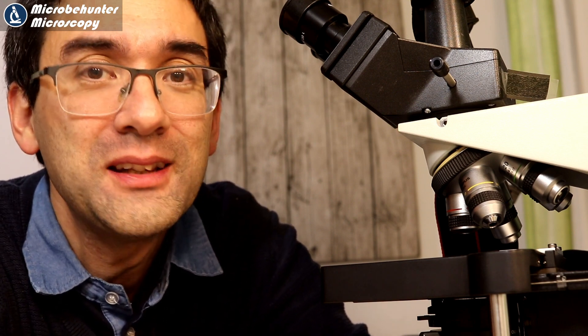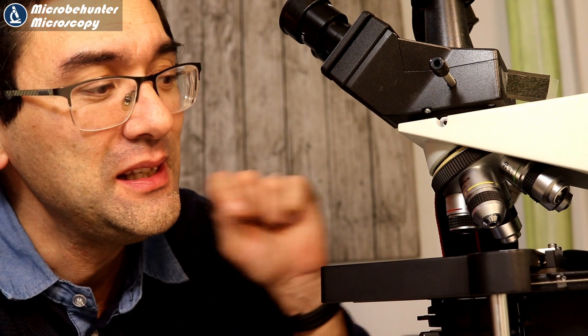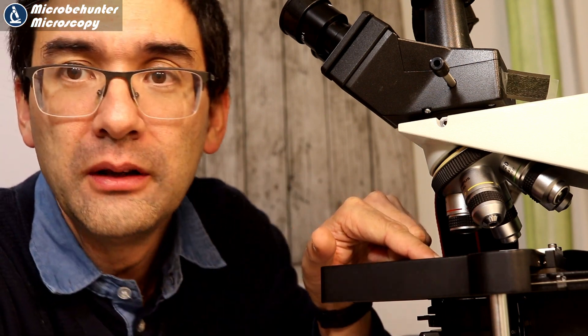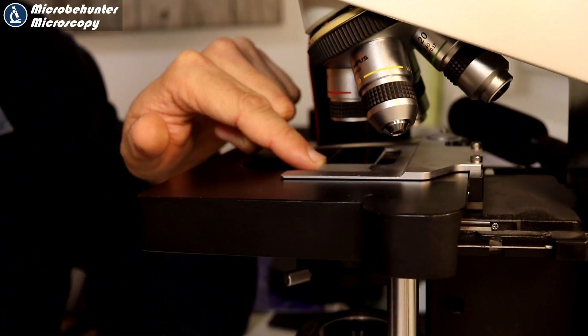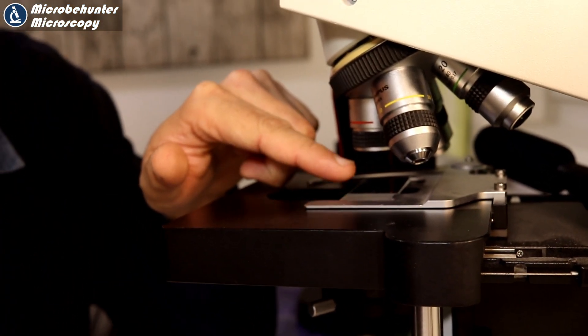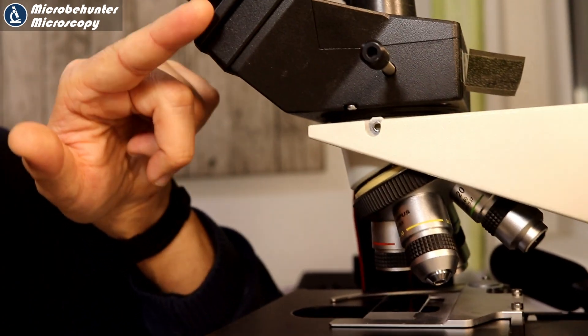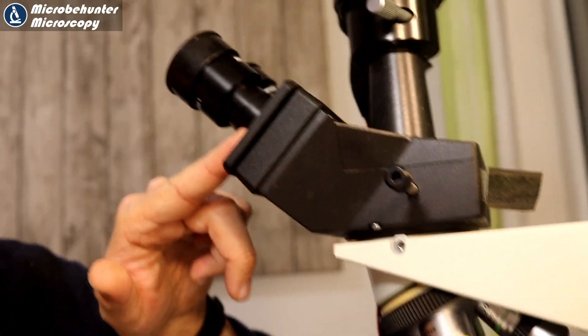This means the distance from the object - I'm gonna lift up the camera again here - from the slide here, from the object, all the way up to the place where the image is projected.